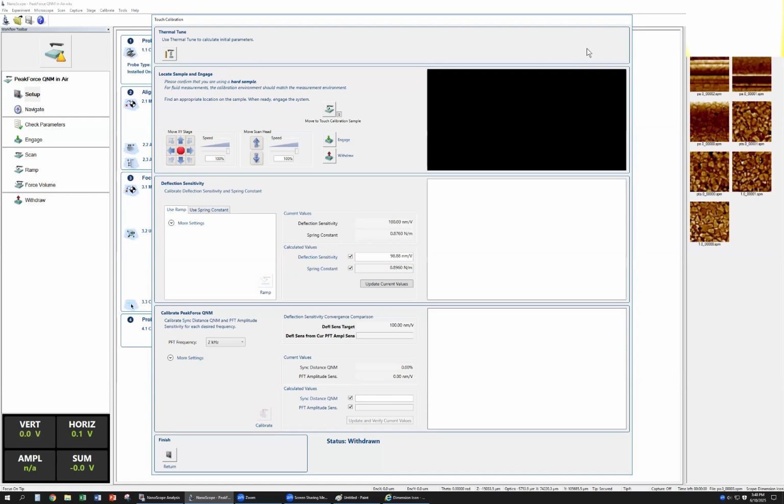现在装个什么针？没装针哈。OK，这个用这个吧哈。OK，这个。That's put here. We load the probe. So we should use which one is the best one?